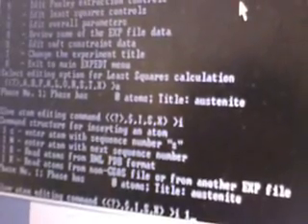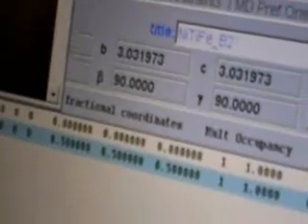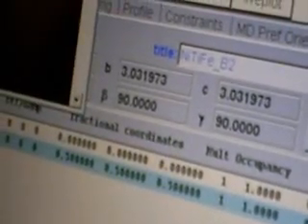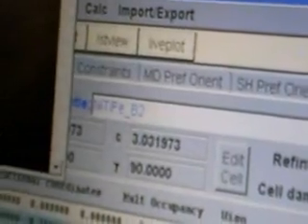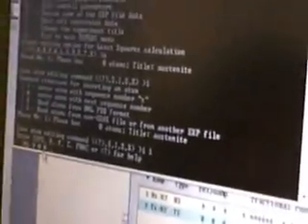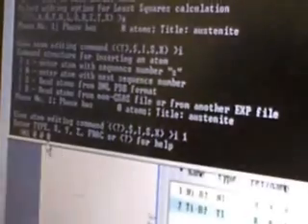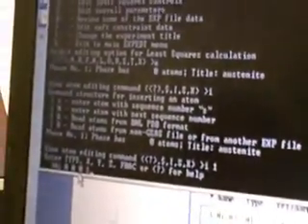Next sequence number? Yes. You know, just the I want to insert the insert the first items. I want the first type. What is the type? Let me go back to my chi chi. You see, I did sell here. Here, items. Tab. So I will I will do the first one as Nickel. What is the X, X, X, X. You see, this one, X values. Yes. Coordinate. Zero, zero, zero. So I will give a zero, zero, zero, right? And then fraction is 100. Fraction 100, I will give a equal one.